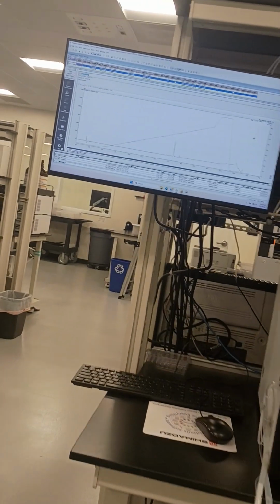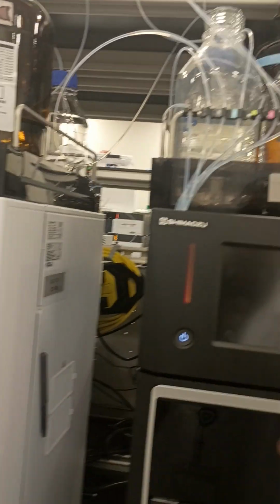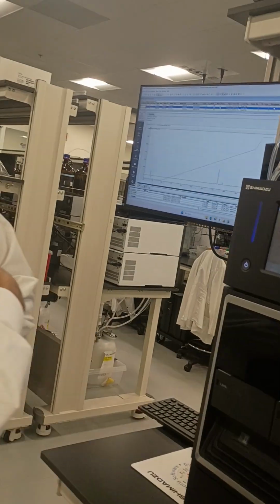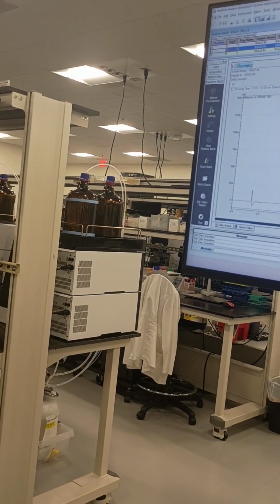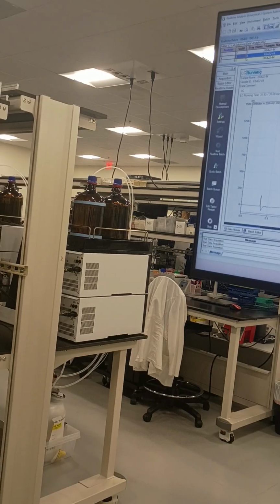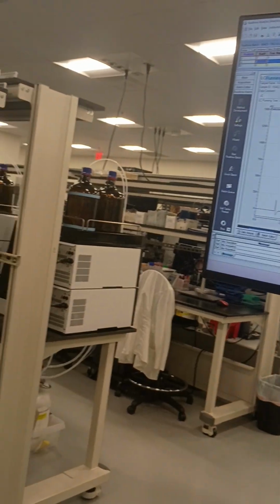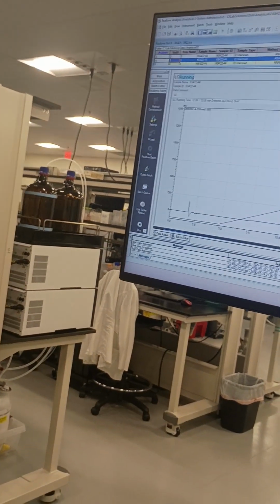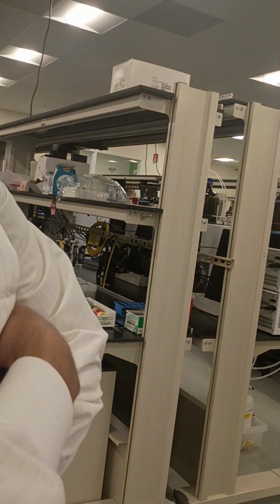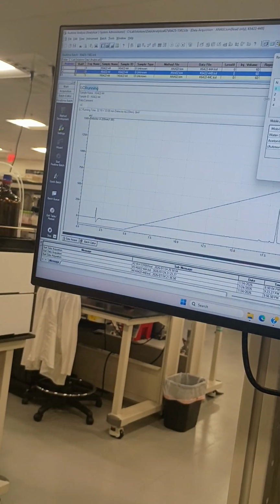So here's a perfect example. This is blue, it's running. This is orange, it's off. So these two are off, and these two are going to run overnight. When we let a program run overnight, we already put it on shutdown. If you notice, there's 1, 2, 3 shutdowns already, meaning when the program is done, the computer is going to shut down everything, kind of like earlier. The only difference with this is you have to do a double shutdown.